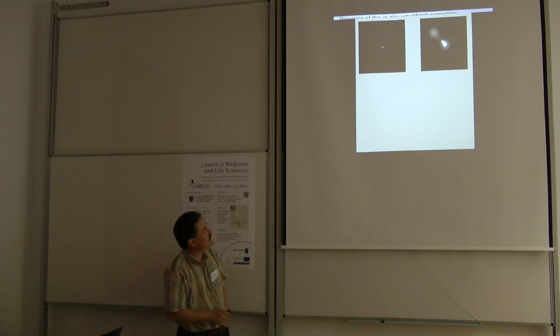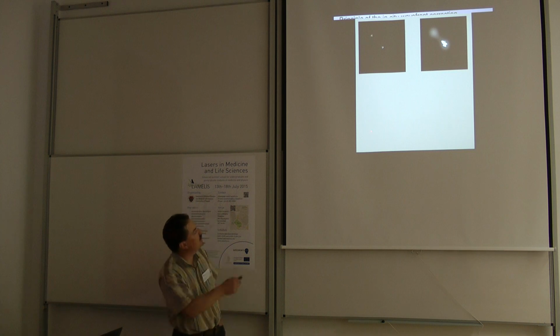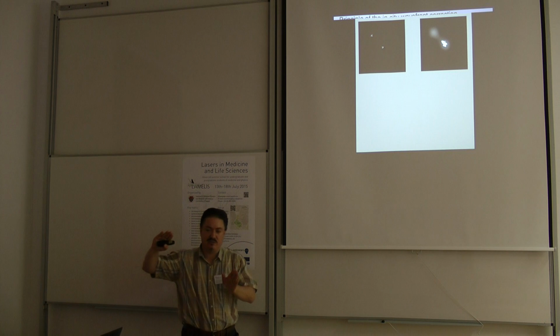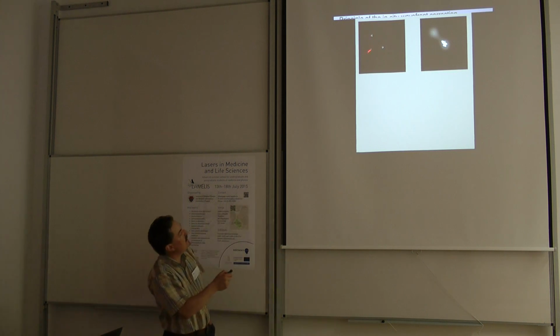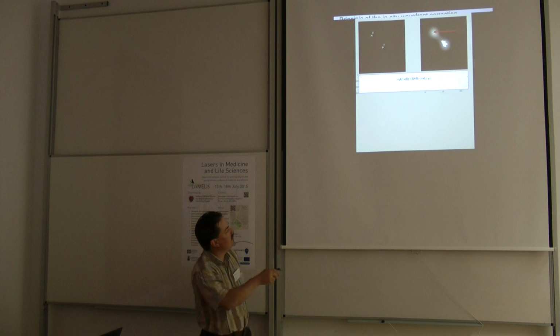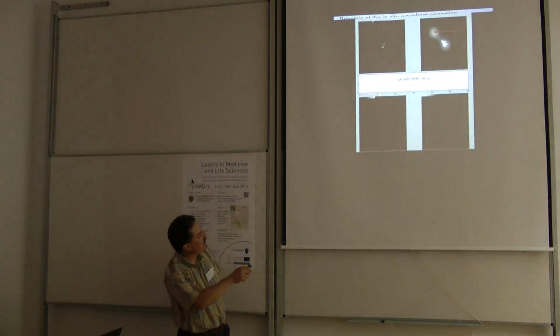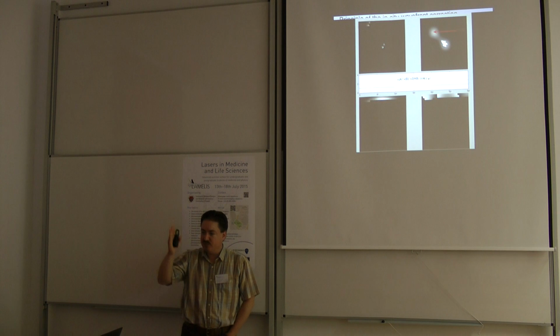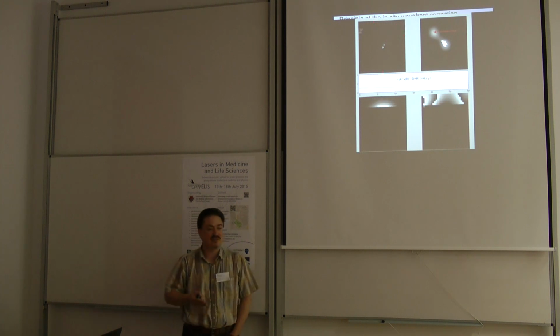And then I turn on another one, right, which will interfere with my reference and gives me a fringe because these two came into the focus at slightly different angles. And when I play with the phase of that by just shifting the grating over the domain, my fringes start moving. And when I put the intensity detector there, I detect sinusoidal functions. And what I want is a maximum. So the maximum tells me which phase I have to use for the tested mode in order to get the constructive interference.